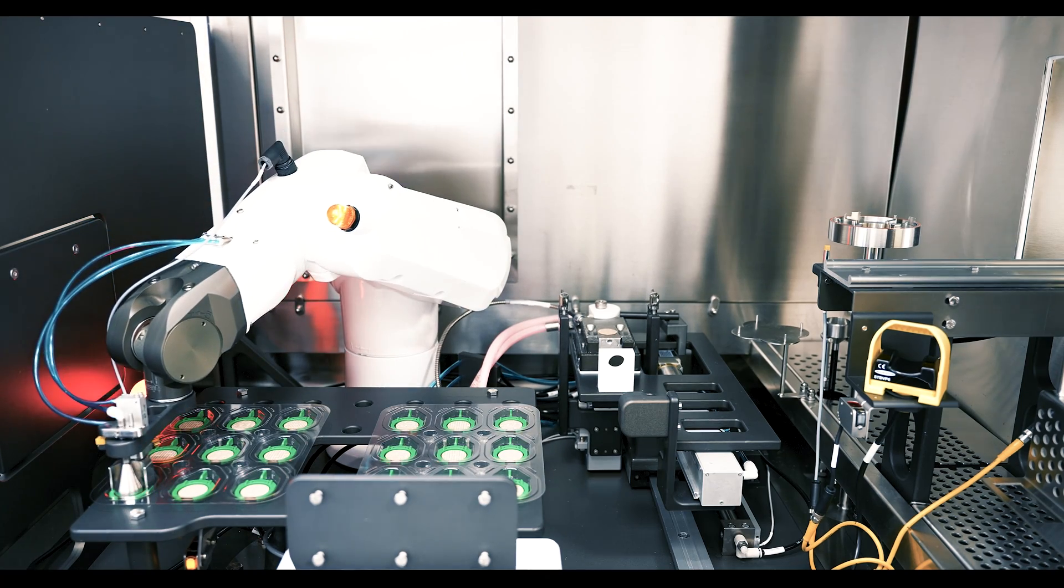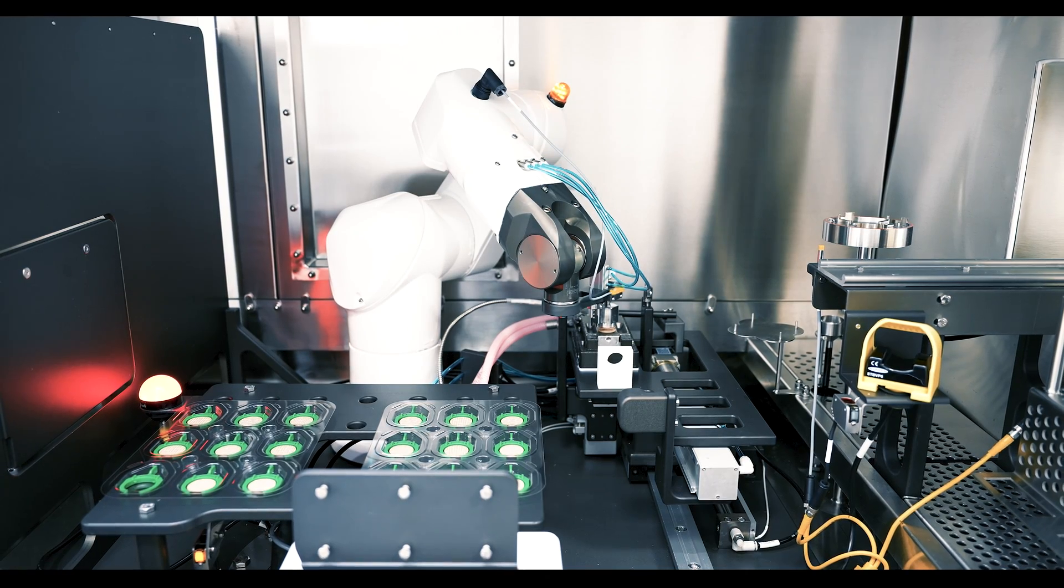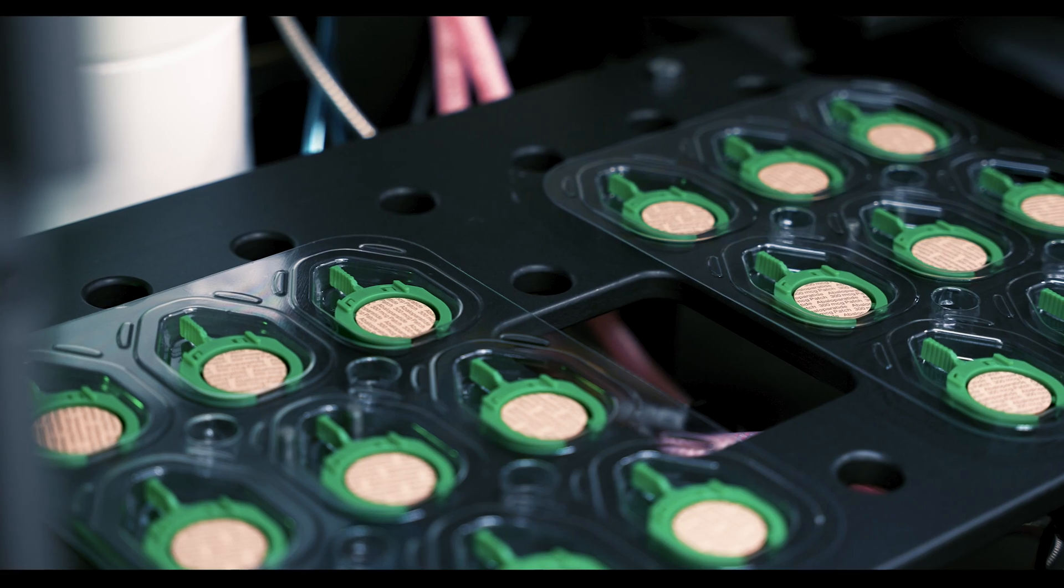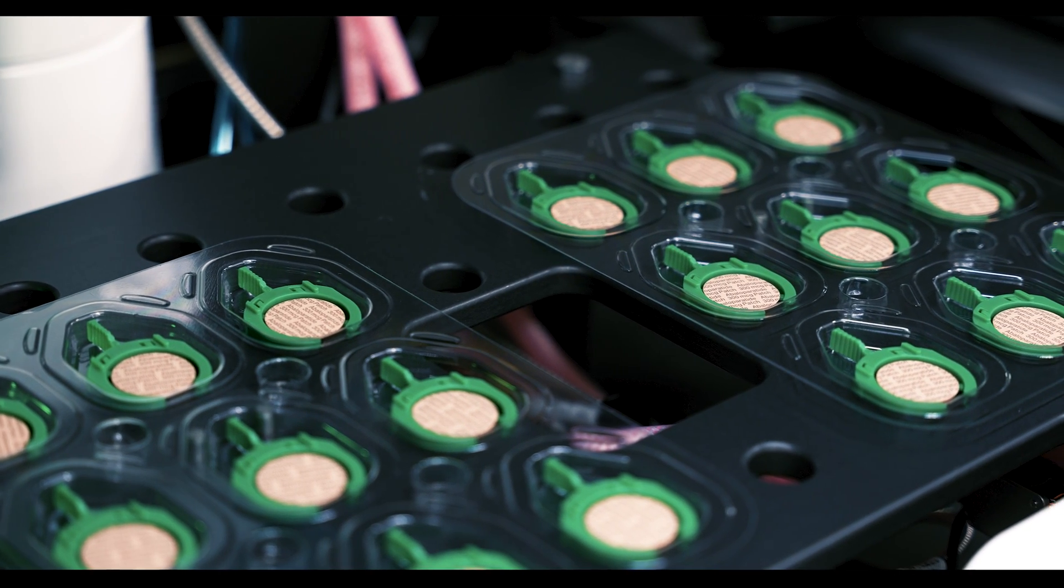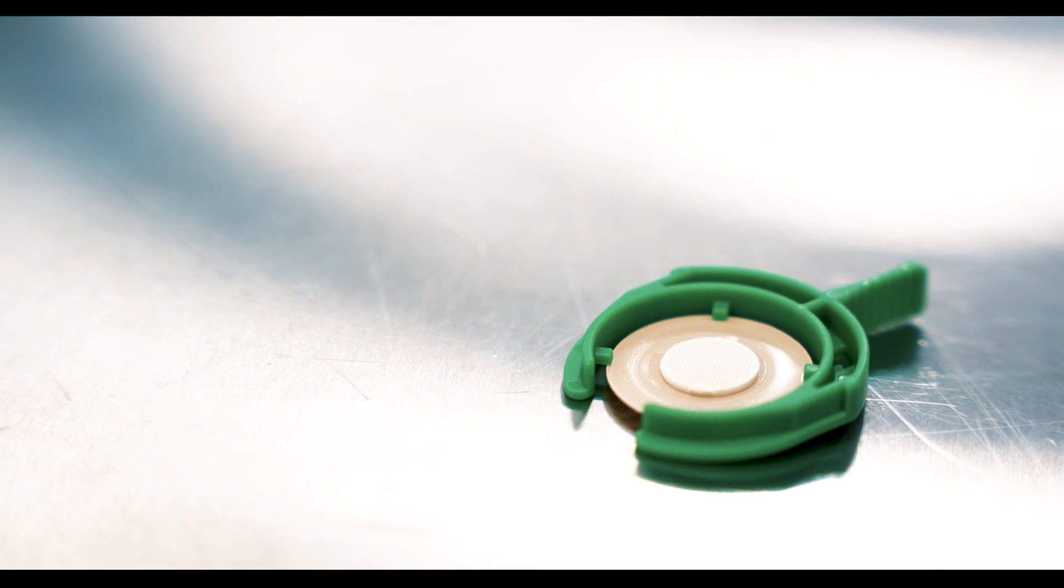So the part-to-part variability is measured in relative standard deviation or RSD. With this machine we're able to drop that RSD from double digits to single digits, which in turn reduces variability for the end user. This product can now meet specifications for the finished drug product.